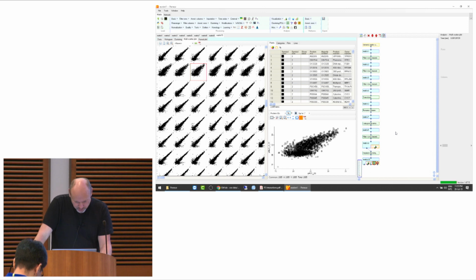And of course, you probably read your journal requirements and so on. So you're actually required to say that you have done this. So when you take out this one replicate from the quadruplicate, you're required to say this, right, in your publication. But you know this, of course, that you have to do this, right?